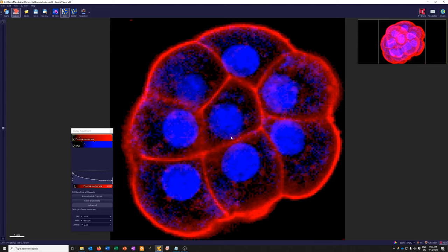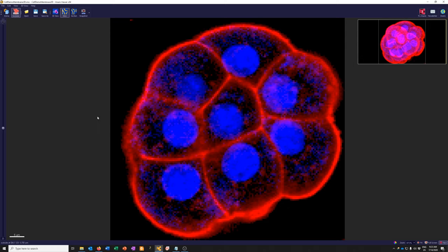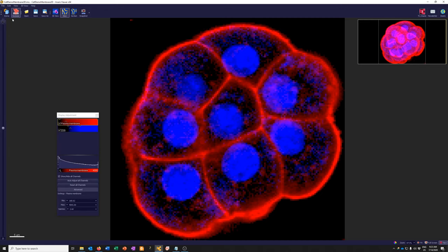Another absolutely critical element when using Imaris is the Display Adjustment window. There is a lot you can do here to adjust how things look — you will never be adjusting the actual data, but you can make major adjustments to the visualization and highlight certain features. If it doesn't pop up automatically, go to Edit menu and choose 'Show Display Adjustment,' or press Ctrl+D.